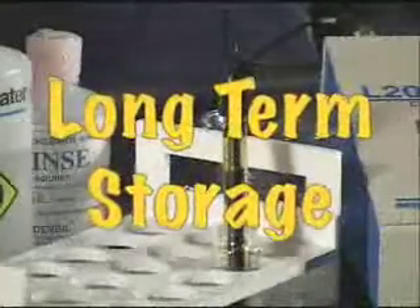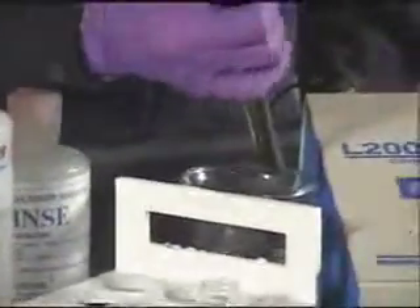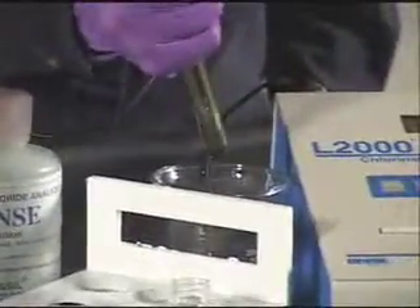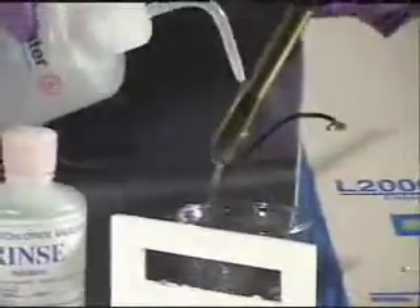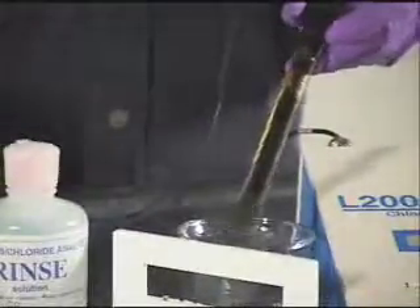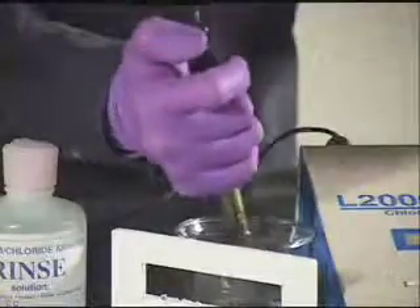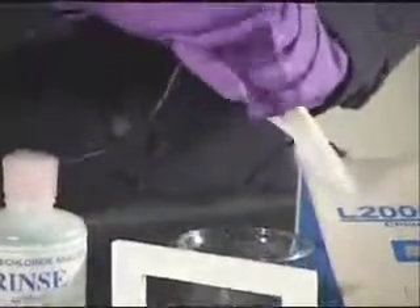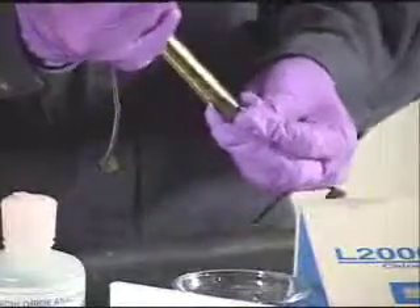Long-term storage: Push down on the top of the electrode and drain all the electrode filling solution. Rinse the inside and outside of the electrode with distilled water. Replace the protective cap over the electrode pellet and store in the L2000DX carrying case.